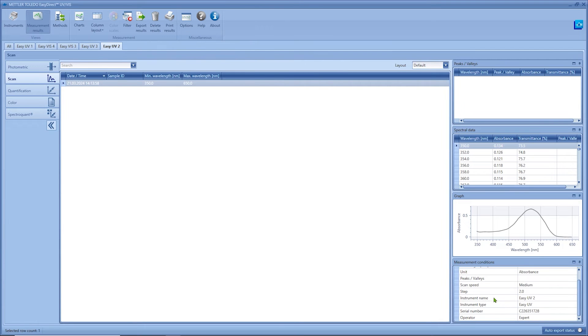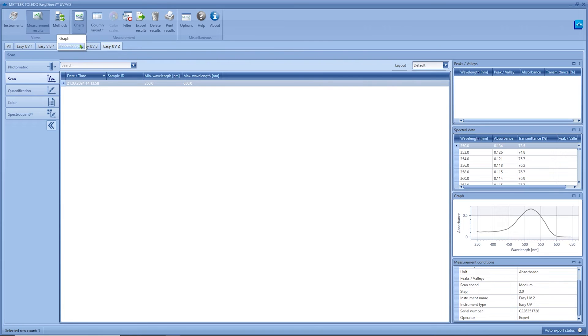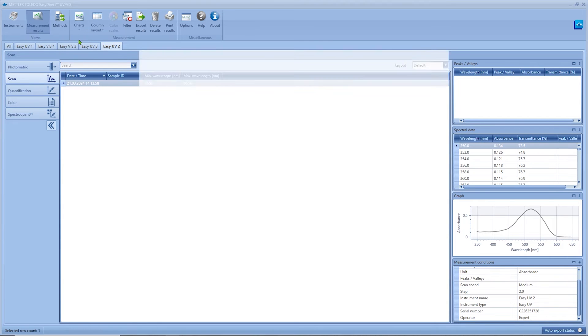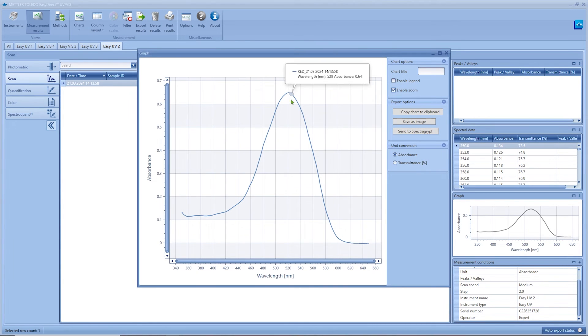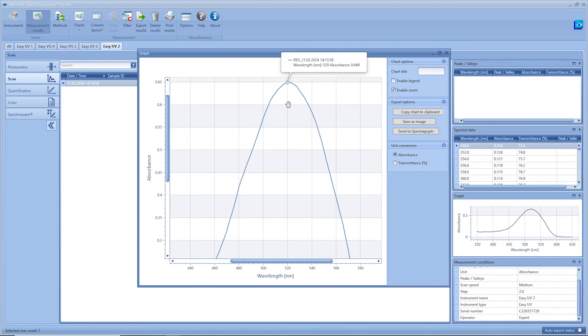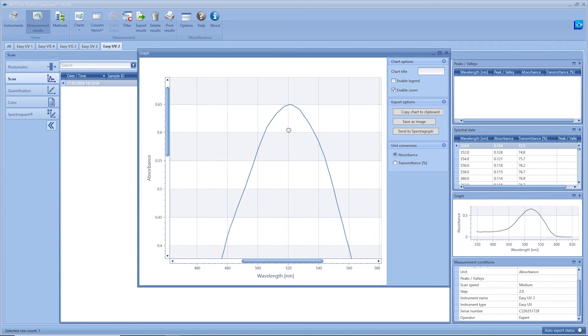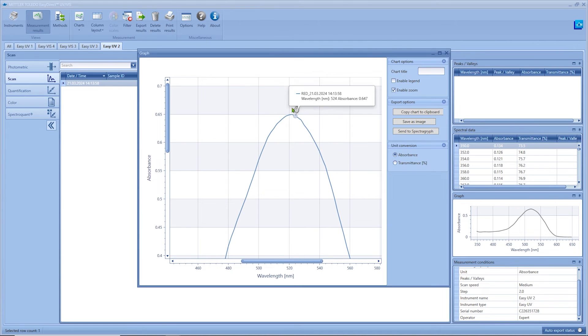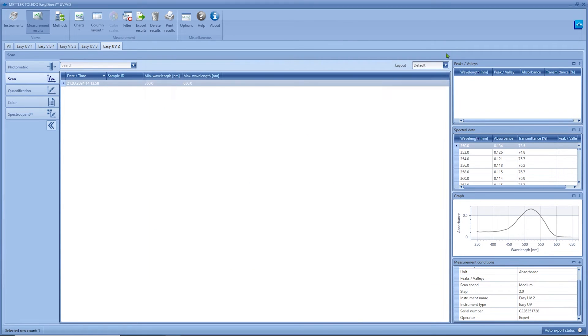To analyze the spectrum in more detail we can choose between two options: graph and spectra grief. With graph the spectrum will be displayed and you can zoom in and stack spectra with a multiple selection of entries.